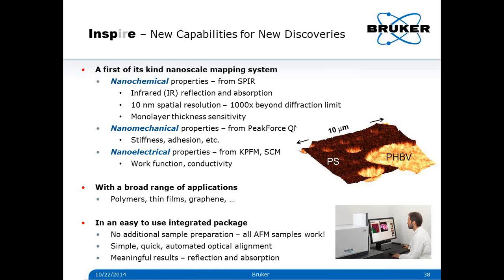Question: what are the infrared power levels incident on the sample? What's the estimated spot size of the laser on the sample? Well, that's also a good question. So spot size would be around, I think, 10 to 20 micrometers, something like that. It is, of course, limited by diffraction, slightly larger. But the power levels are not very high, so let's say 1 milliwatt and below on your sample. So you don't risk damaging your sample here.